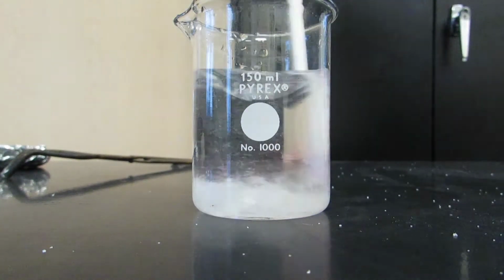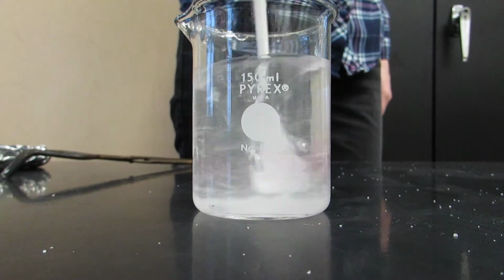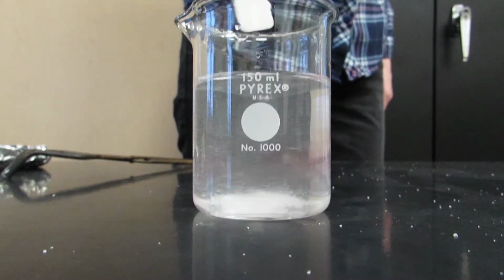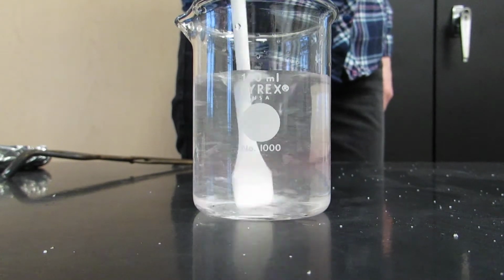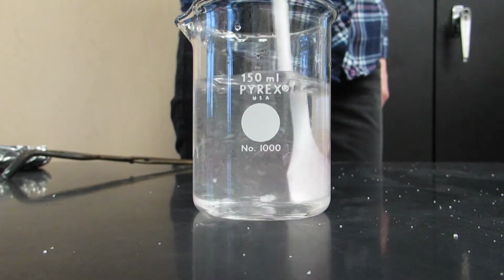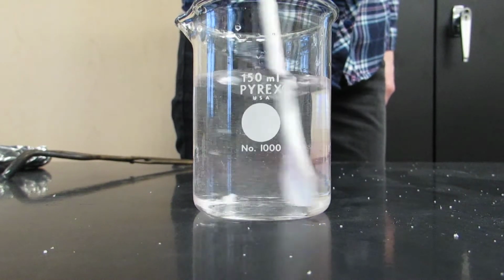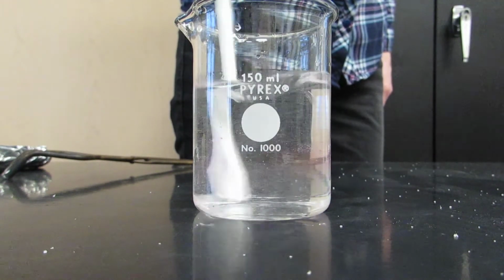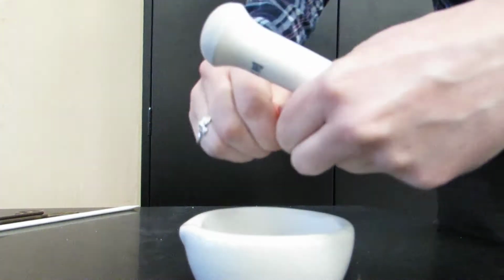For the fourth experiment, we are going to take some sugar and put it in water and stir it up. For our fifth experiment, we are going to crush some chalk using a mortar and pestle.